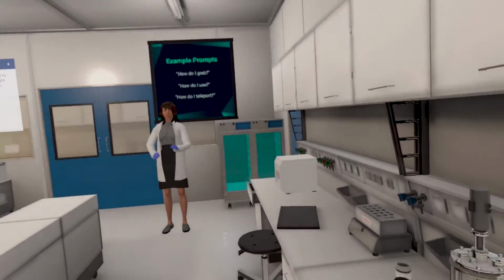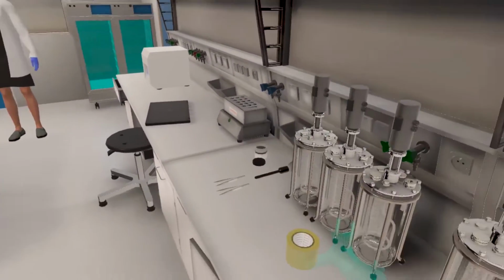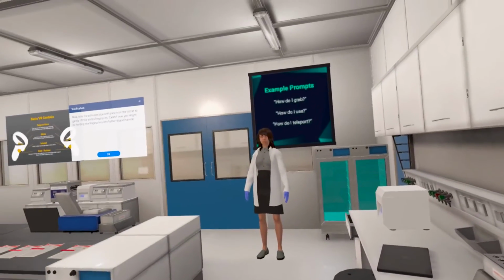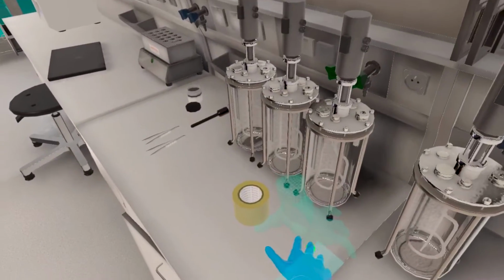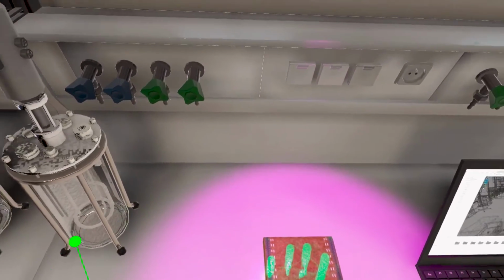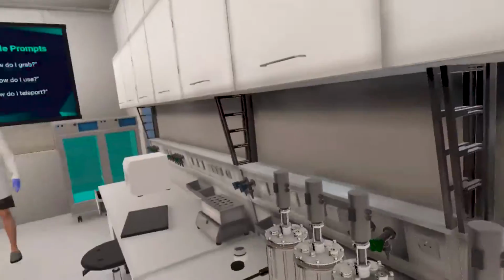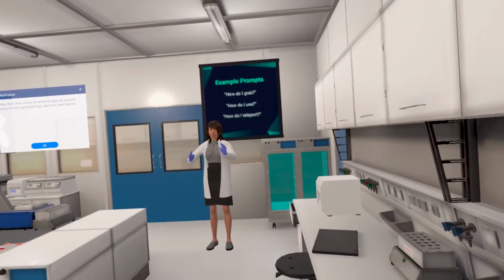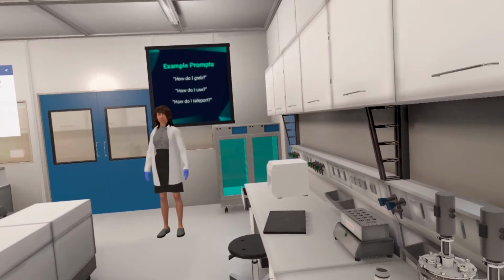Now, take the adhesive tape and place it on the wallet to gently lift the visible fingerprint. Careful now, you might be holding the fingerprints of a batter-dipped person. Well done. Now, collect the adhesive tape and properly place it in the highlighted bag, which has been labeled.